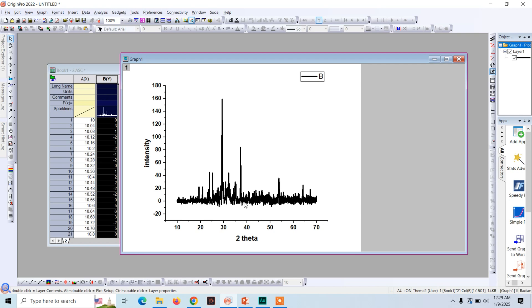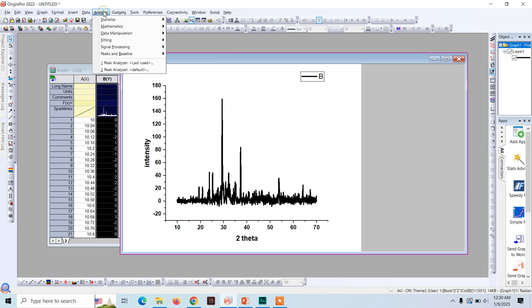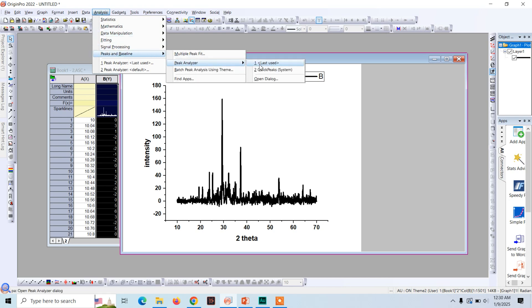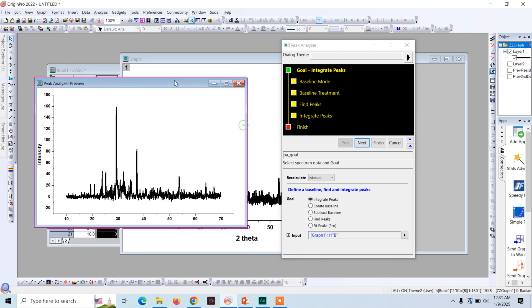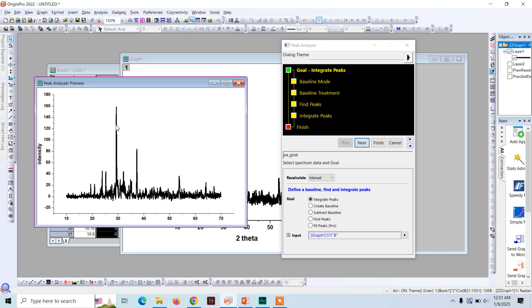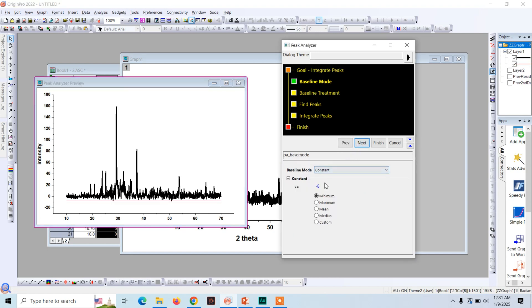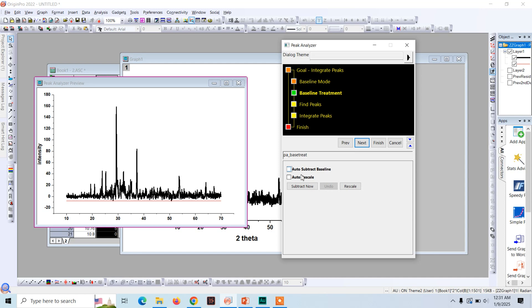For calculating the crystal grain size we need to calculate full width at half maximum. For calculating the FWHM in Origin, click on Analysis, click on Peak and Baselines, and now Peak Analyzer dialog. First we need to determine the peaks. There are multiple peaks in this chart, but for calculating the crystallite size we will use a single peak. If you want to take the average crystallite size, then you need to calculate the full width at half maximum for all the peaks, but right now for simplification we will use just a single peak.